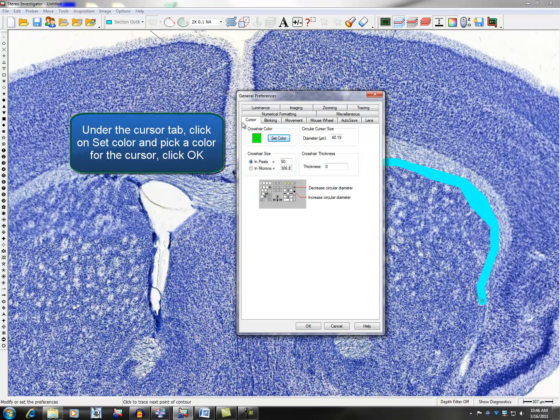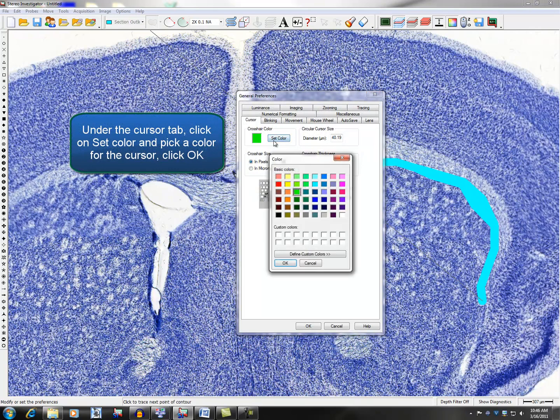Under the Cursor tab, click on Set Color and pick a color for the cursor. When finished, click OK.